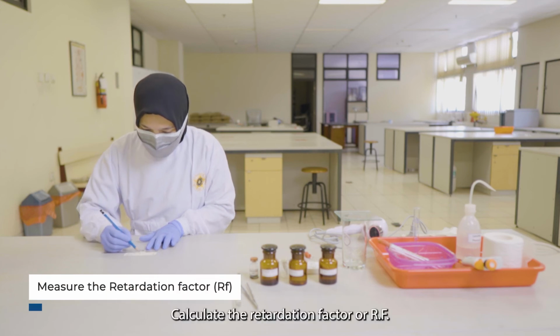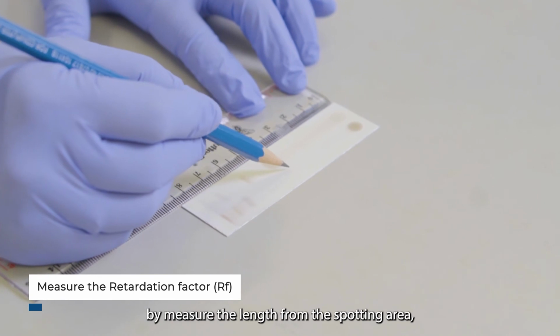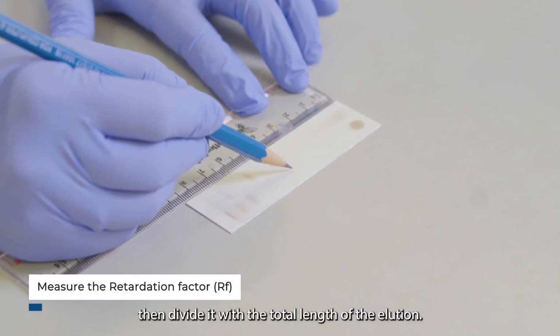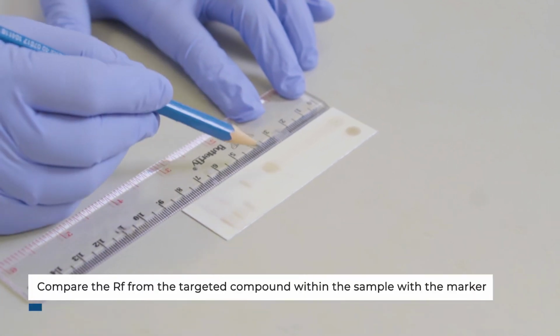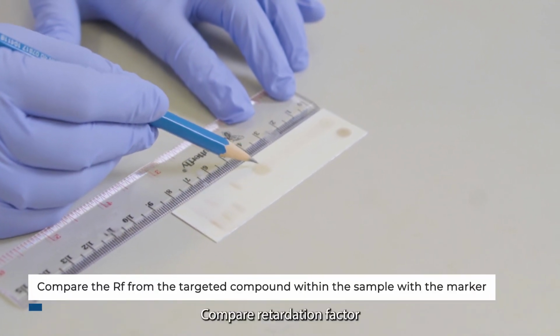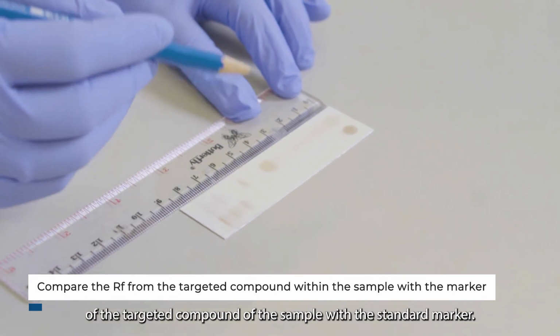Calculate the retardation factor or Rf by measuring the length from the spotting area, then divide it by the total length of the elution. Compare the retardation factor of the targeted compound of the sample with the standard marker.